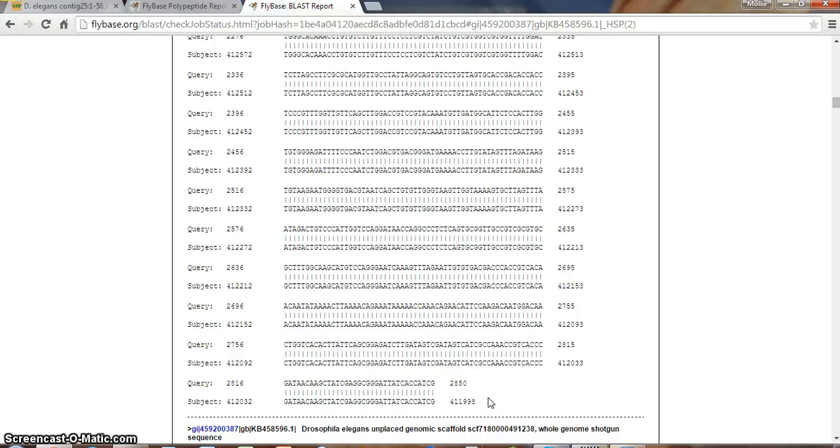But when we are looking at where our gene falls, we do still want it to be falling within the Contig. And we're going to find that when we're blasting our genes against the elegans assembly, we're also going to be seeing the beginning coordinates of our gene that are larger than our ending coordinates.